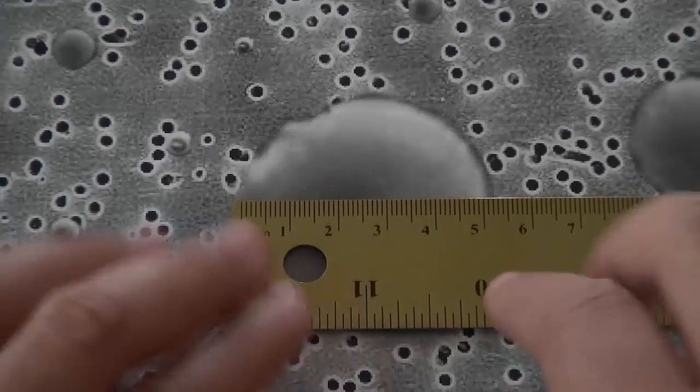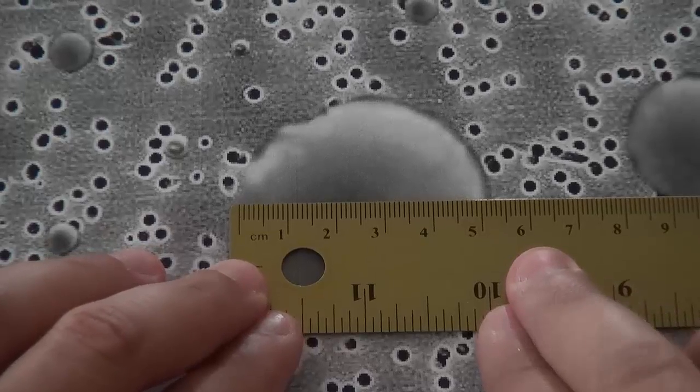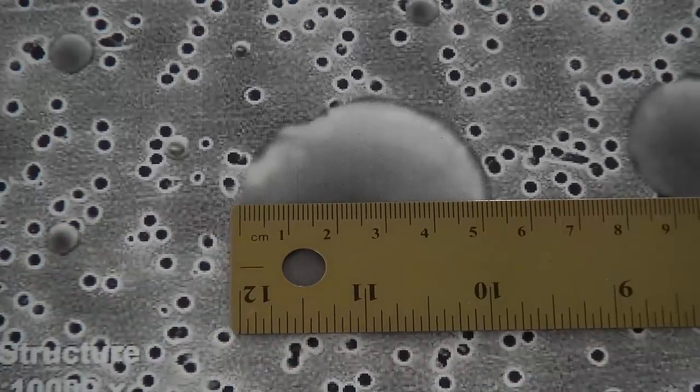Identify all particles in the field of view image and measure their corresponding diameters with the ruler. For the particle shown here, the diameter is about 5 centimeters.